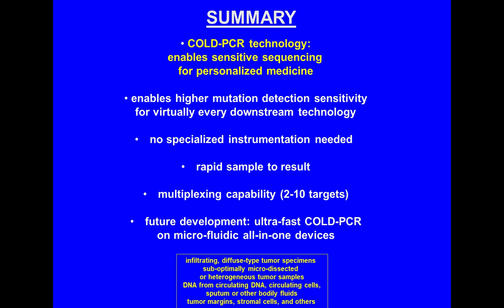If you go to even more targets, basically you can potentially choose NGS. If you want one target, you can potentially do ddPCR if you have the instrument. But for targets where you want to get to the answer rapidly without much expense, potentially before you do NGS, we see that ice-cold PCR is a good solution.